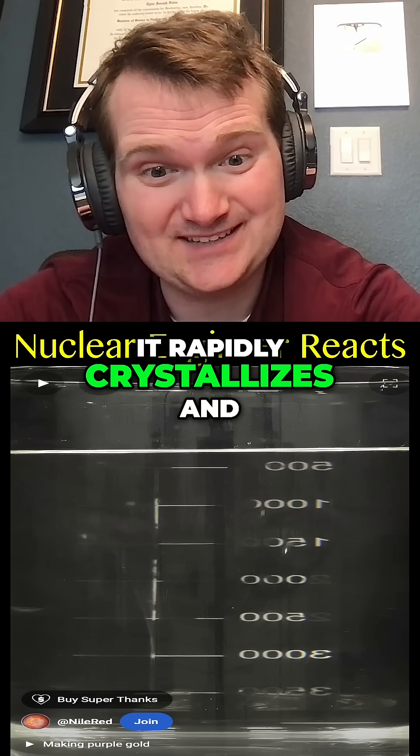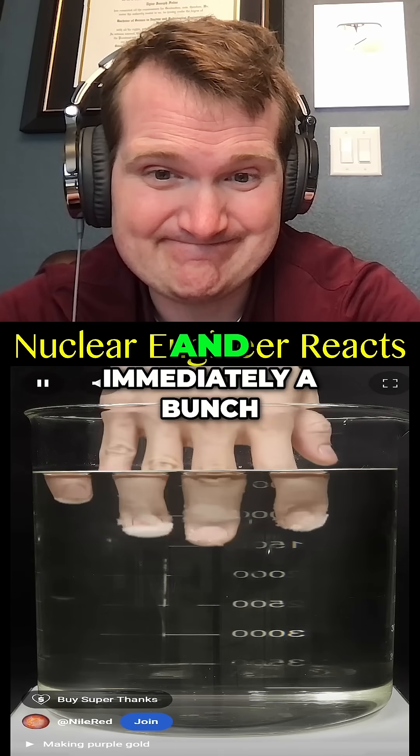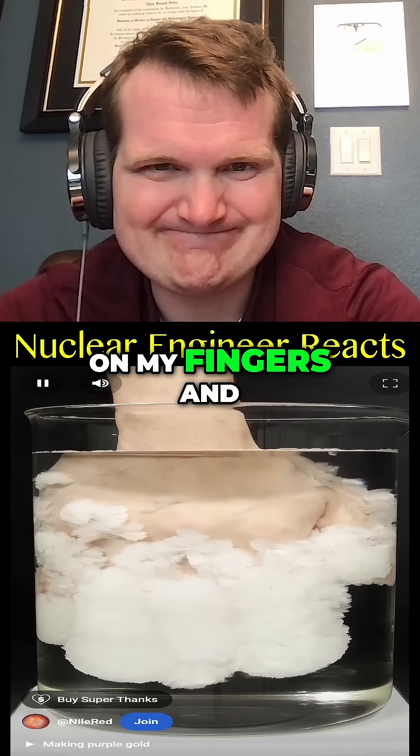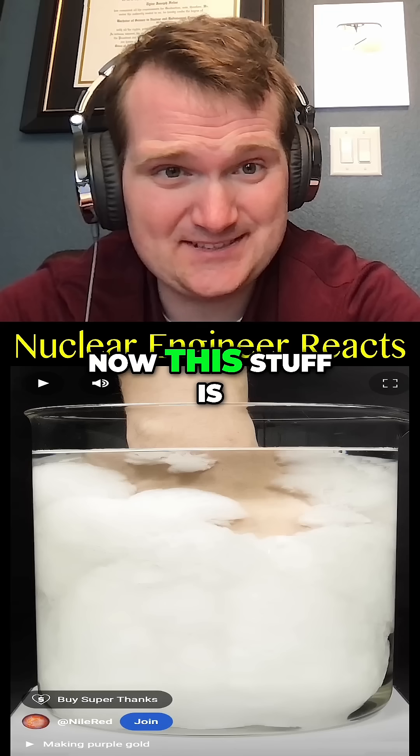Despite that, I just went for it, and immediately a bunch of crystals started forming on my fingers and I could feel everything quickly getting hotter and hotter.